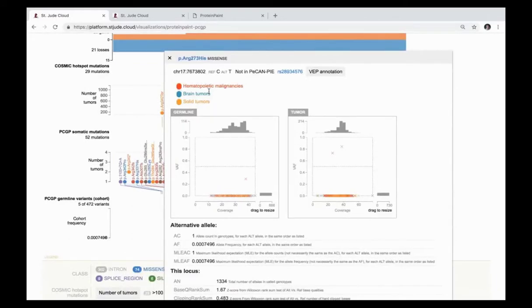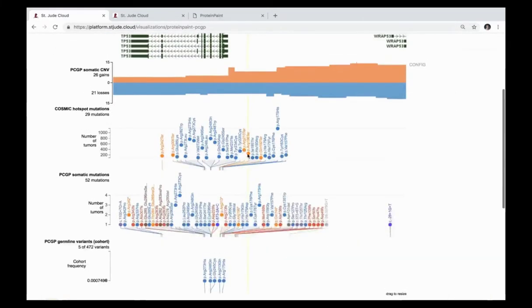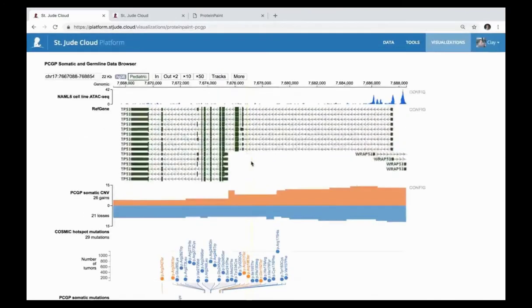That's protected access, but in this case we have a sample here, the germline sample in this graph, which has a variant allele frequency of probably about 0.35, and then you can see it also light up over here as it's up to around 0.75. So in this case, you might examine this and say, hey, that looks similar to a loss of heterozygosity event in this sample, things like that. There's a lot of really cool things you can do. I'd encourage you guys to go out there and explore this, give us your feedback, things that you would want to see in this.